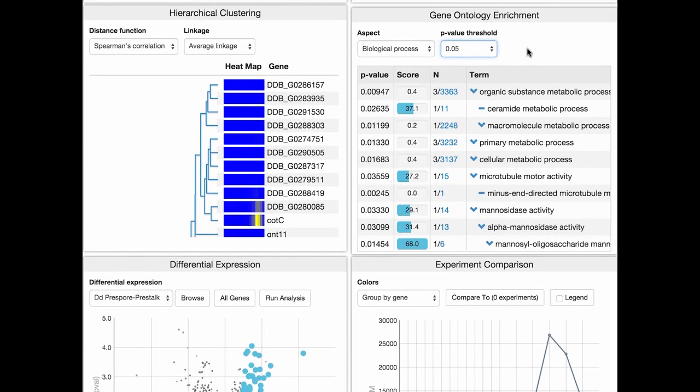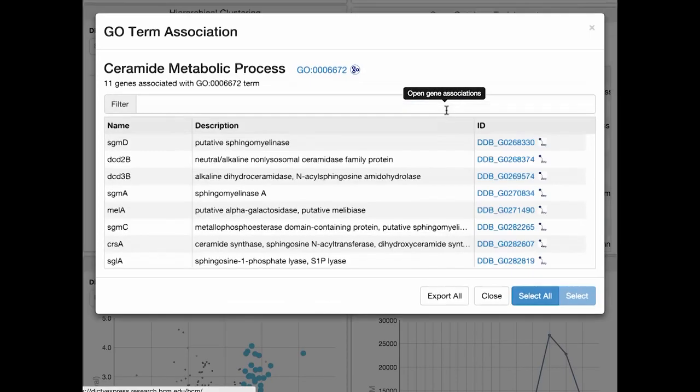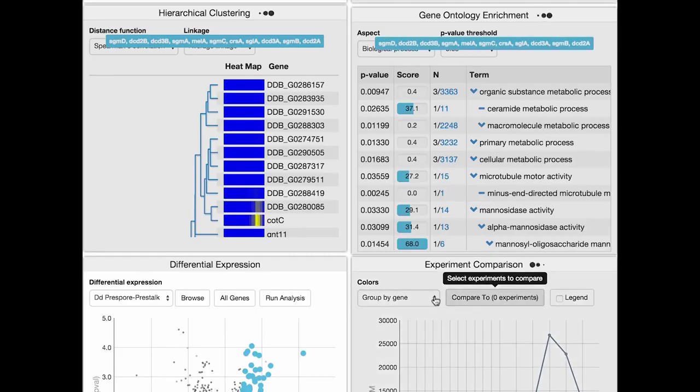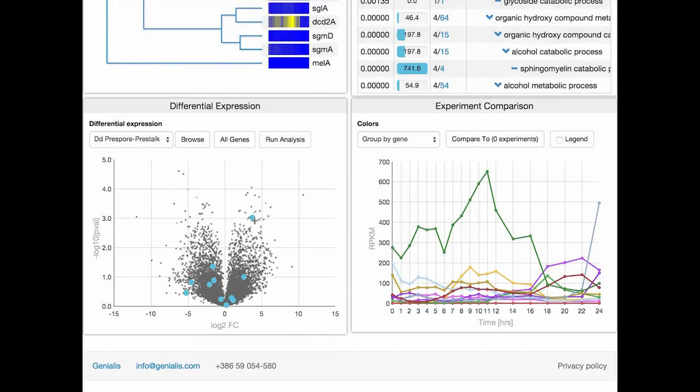Let's look if the other genes in the Ceramide metabolic process are also differentially expressed. Oh, just the DCT3B was differentially expressed in the pre-stalk versus pre-spores. Notice how easy it is to navigate through Dicta Express and change the scope of our analysis.